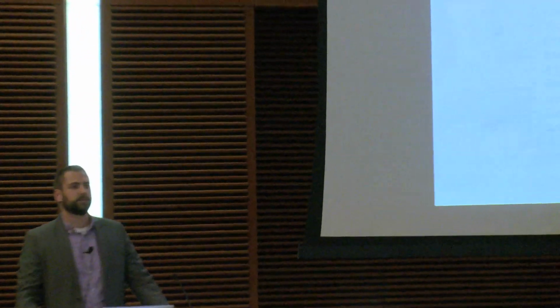Yes? Not currently. That is the next thing we have to tackle. This is simply a 2D stitcher. You can do it through time or multiple channels, but you can't do a 3D volume yet. No, that is, again, we've got that in MATLAB, but we don't have that in the ImageJ plugin. The one example we had in MATLAB was a circle inscribed in a square, and we can handle that with the MATLAB code, but we can't with the full Fiji plugin. Again, it's on the to-do list. Any other questions?